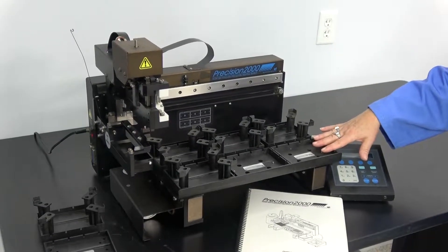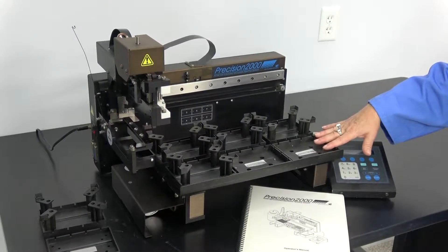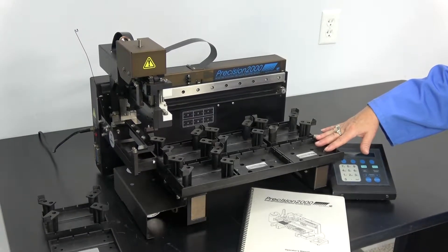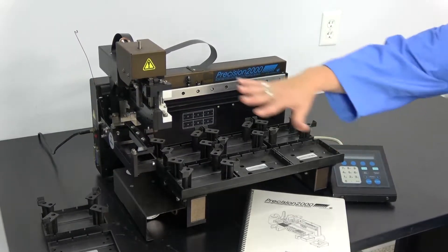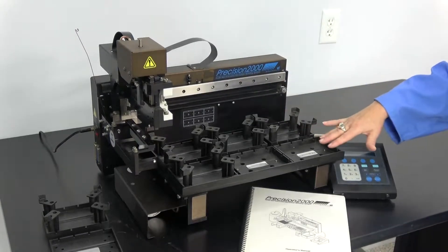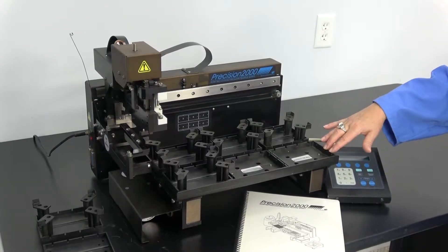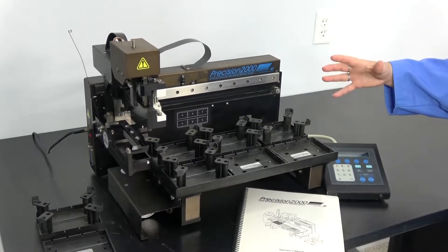This particular system can handle 96 or 384 well plates. It can be set up for 8-channel or single-channel pipetting. Its size allows for it to be placed inside a biological containment cabinet or inside your standard chemical fume hood.